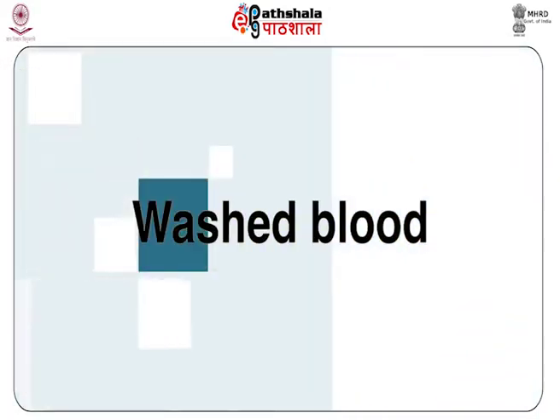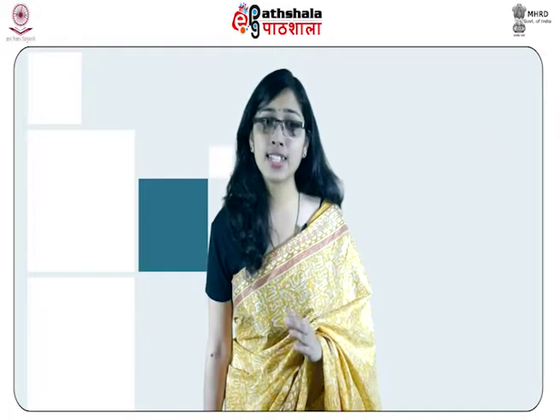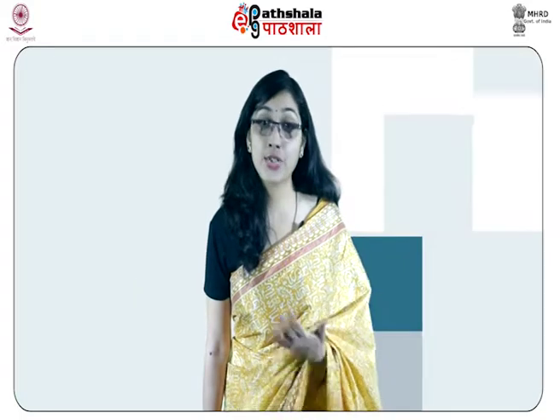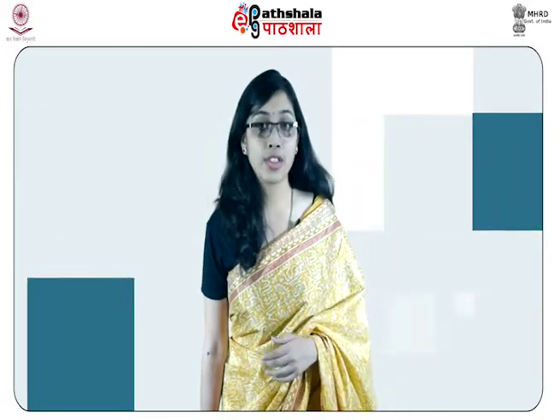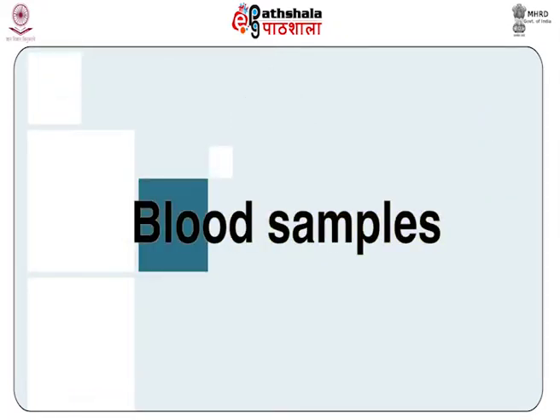Then the washed bloods. If the blood found at the scene of crime or on the clothes has been washed, it is still possible for the laboratory staff to detect traces of blood from the washed materials. Next, about the blood samples.